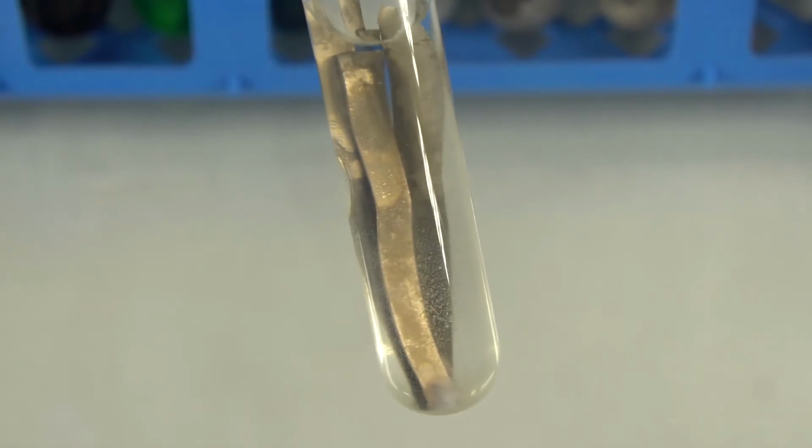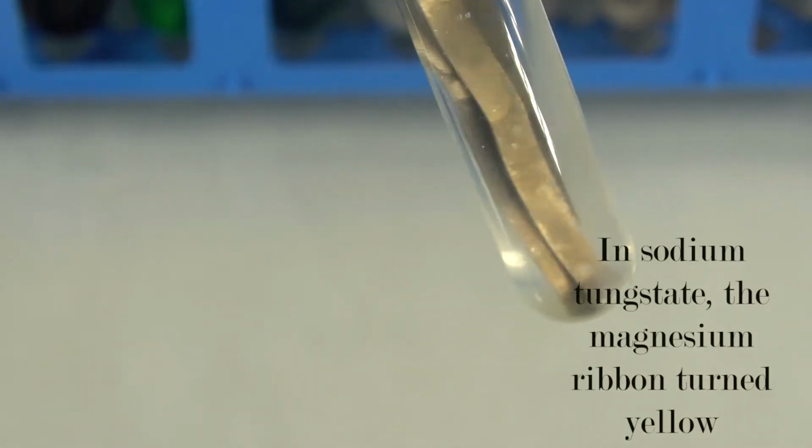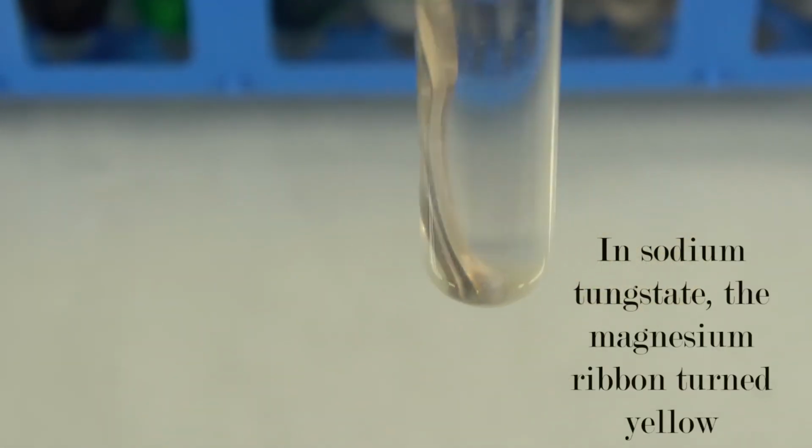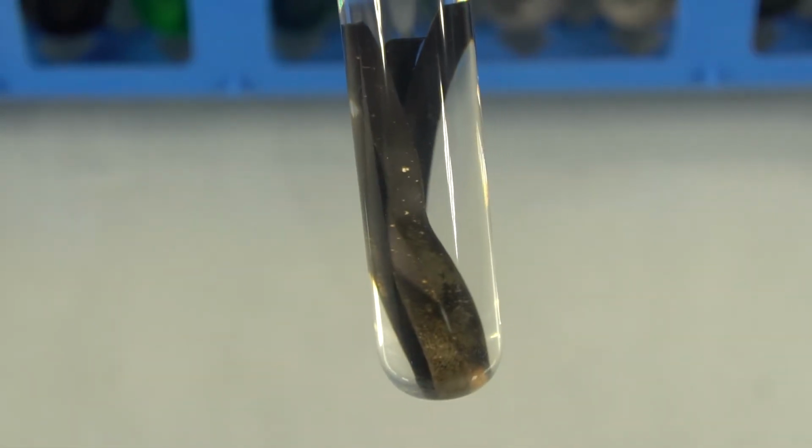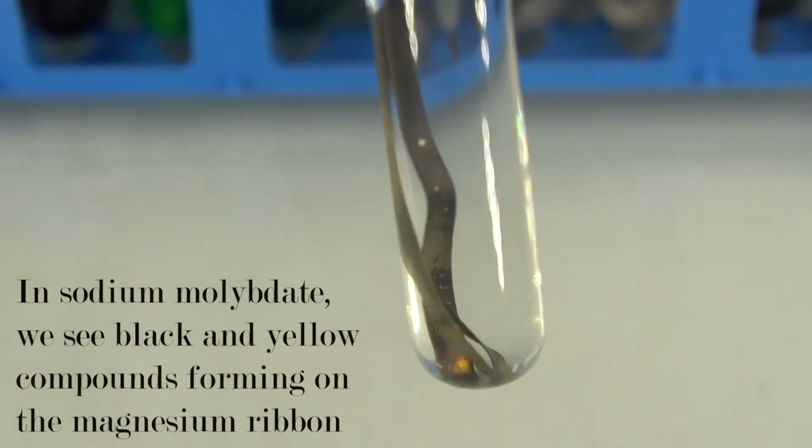precipitate of ferric hydroxide. The sodium tungstate did not have much of a visible reaction, but you can see some discoloration on the magnesium ribbon in the test tube. But in the sodium molybdate, the magnesium ribbon turned this dark black color with some yellow spots.